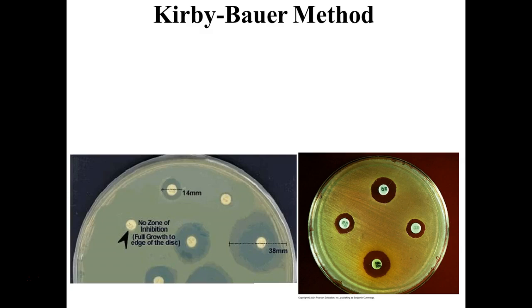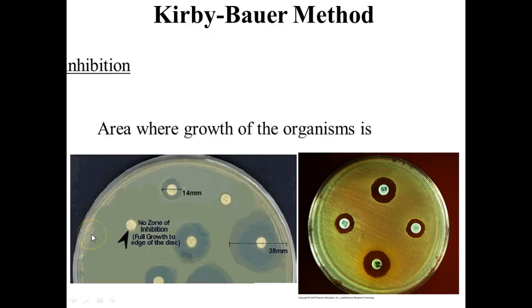For you guys, in case our antibiotic disc came detached, we even wrote the letter above the lines. And I drew these lines the very next day when they were the most accurate. So you'll notice that maybe some of those might have encroached in growth-wise, or the zones might even have gotten bigger as time went on. But that line was when they were accurate, and that's why they were drawn for you guys. And we definitely saw some complete resistance, where it grew right up to it.